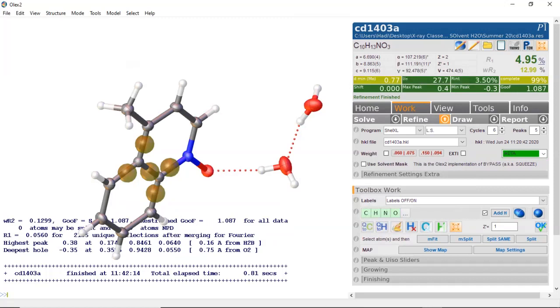Now this D min is at 0.77. That's because we set it to 55 degrees 2 theta. If you wanted to try to get it green, you could even have a lower cutoff of 2 theta of say 50 degrees, and it may give it green, it may not. But light green is okay. As far as completeness, you really can't do anything with this unless you recollect data and collect more data. Maybe you didn't collect enough data when you did the data solution.